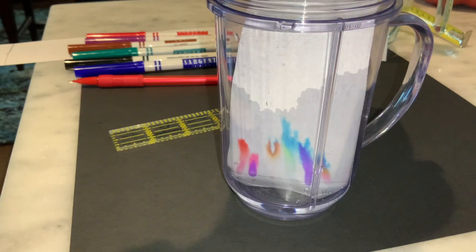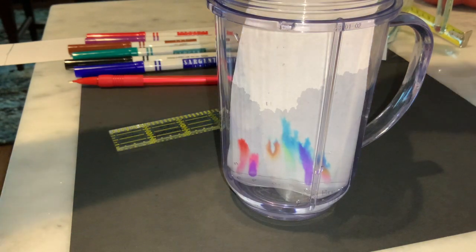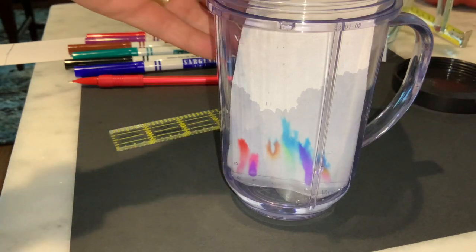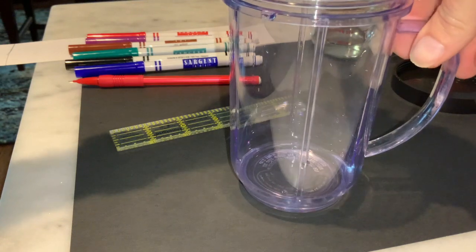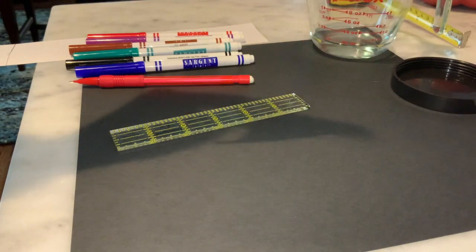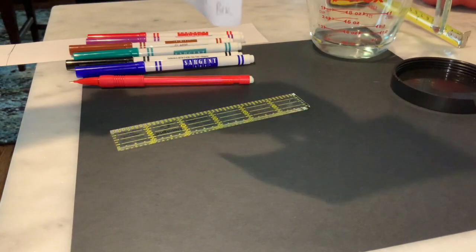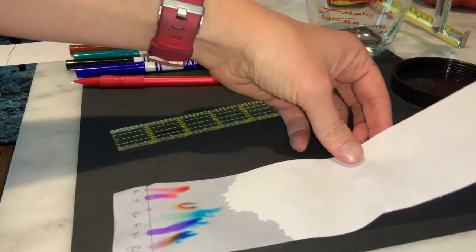So at this point we've gotten enough separation. We haven't gone all the way up the paper yet. We've gotten enough separation that you can see the different dyes present in our markers. So we'll go ahead and remove our paper and let it sit down and dry.